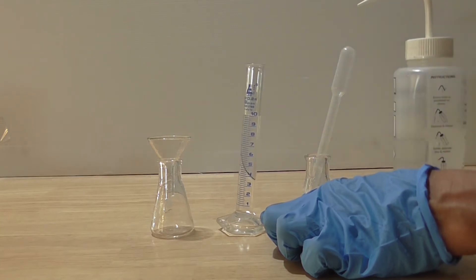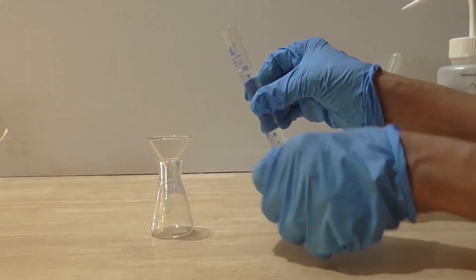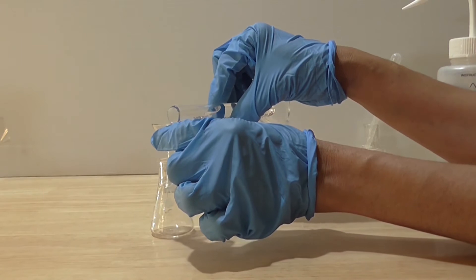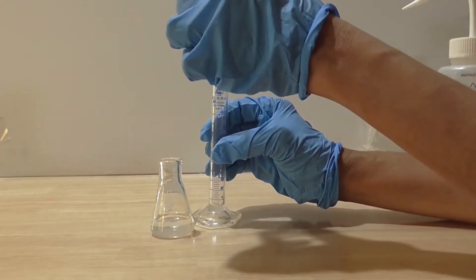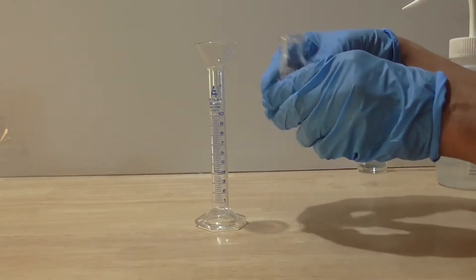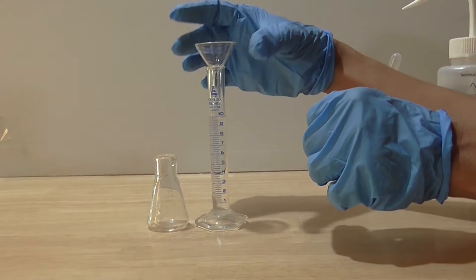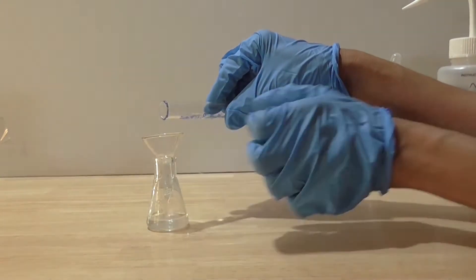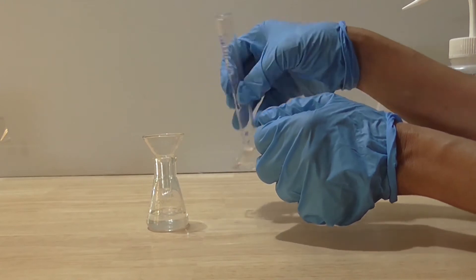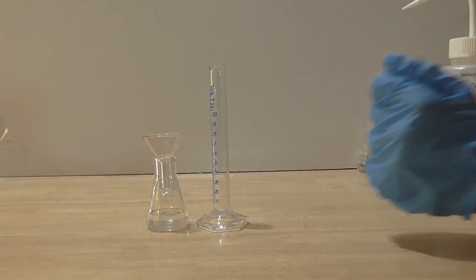I then pour the 0.1 molar acid from the cylinder into the dry clean flask, and I pour it back again to ensure it is well mixed. I now have hydrochloric acid that is 0.1 molar, and I am ready to proceed with my next dilution.